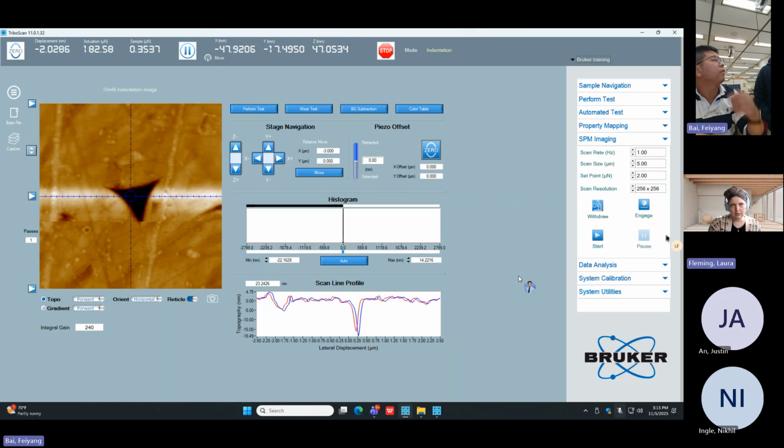On a smooth composite material from imaging, you could do that. There's no way you're going to optically be able to do it, and it sounds like it's going to be too rough for you to image on. No, imaging we can do in the SEM, right? My point is that if you want the indent to land precisely on a particle, so let's talk about it like it's a composite material.